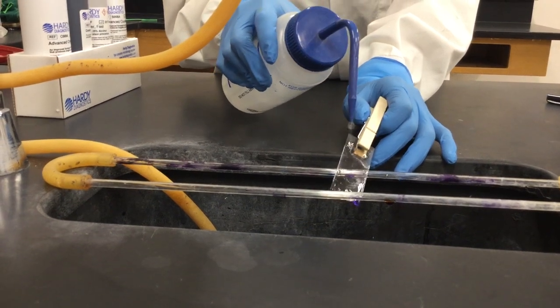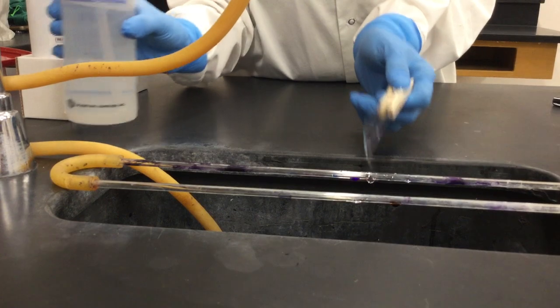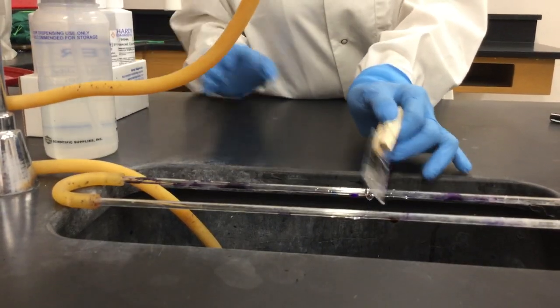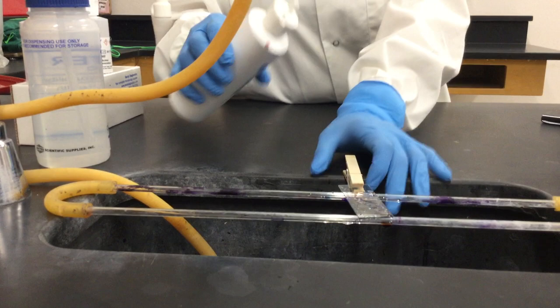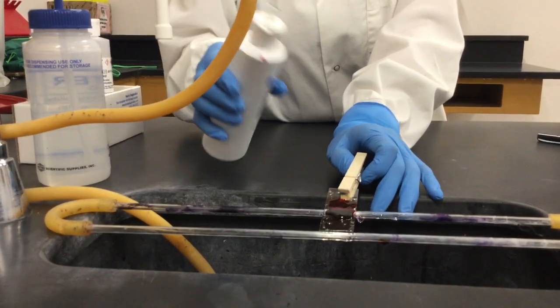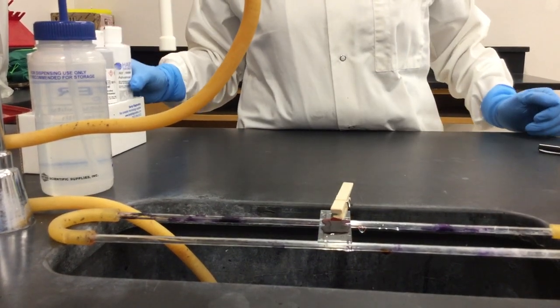So let me rinse and then add the final reagent, which is safranin. And for a minute.